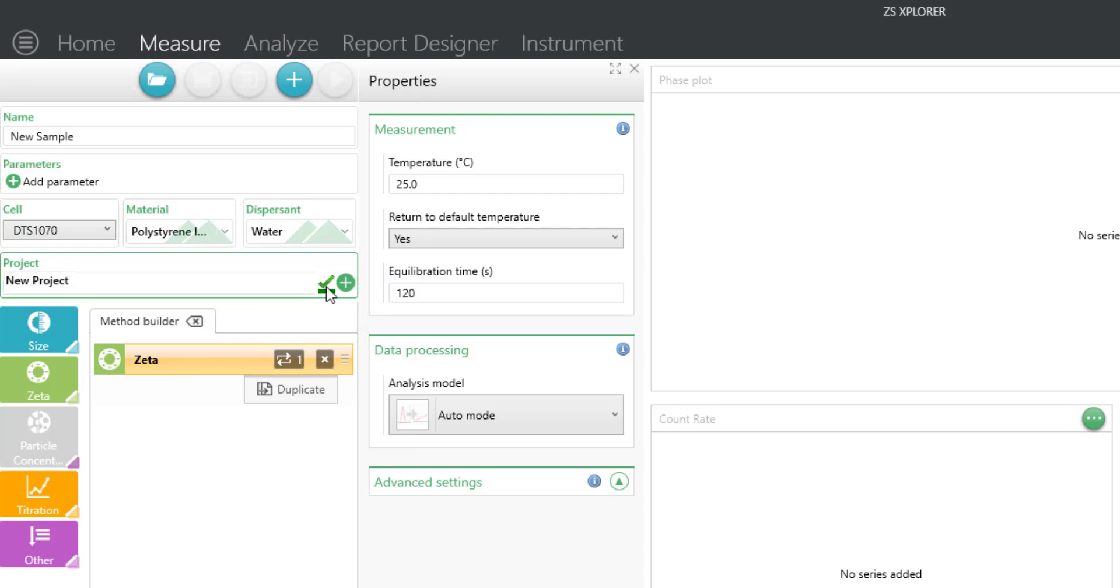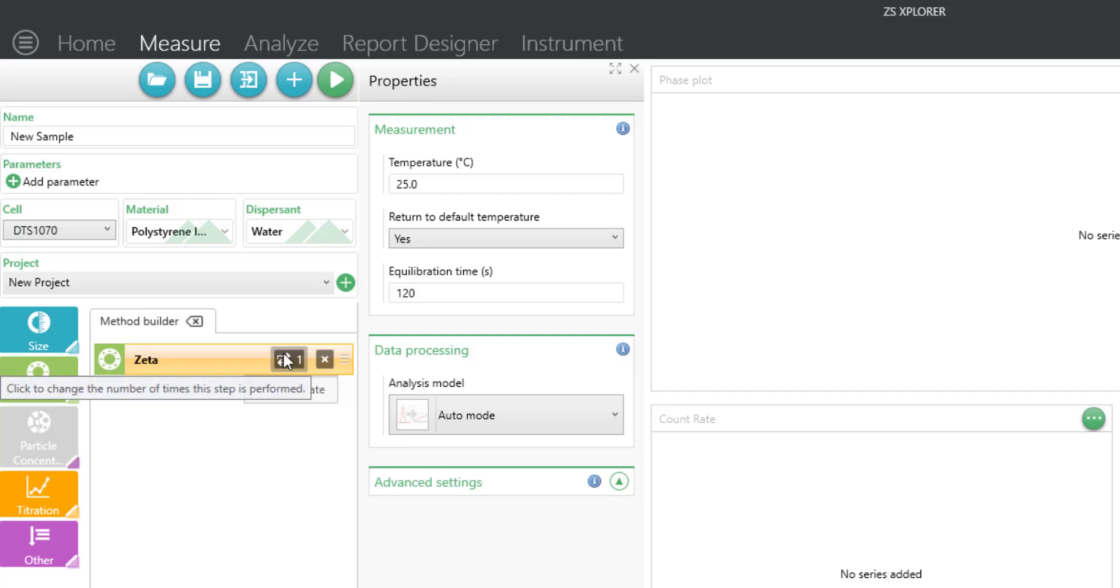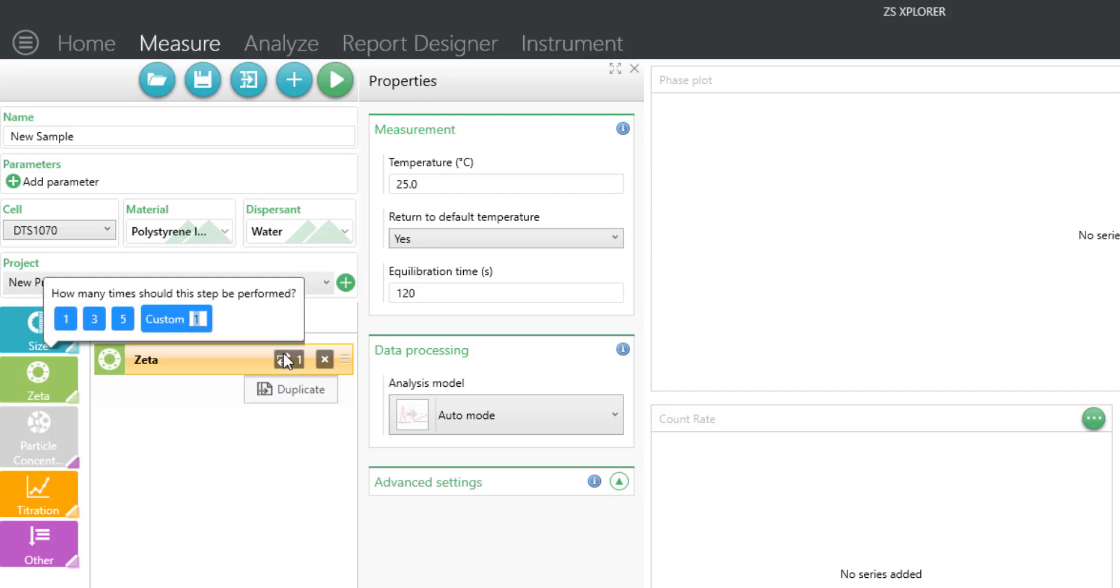Under the method builder, select how many times you would like to make the measurement. It's typical to measure in triplicate to observe any trends or establish consistency across multiple measurements, so in this case we will select three.